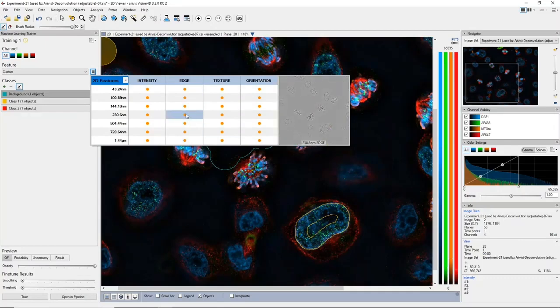And so you generate all of these potential images for all of these potential channels, and you look for how different those pixels we've selected are from what is background.